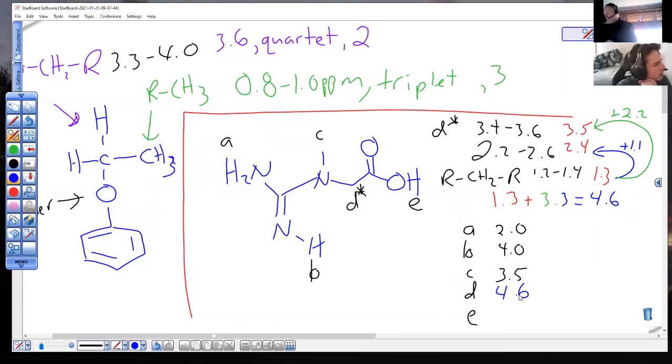Why'd you use RCH2R for D? I had to. What would be the closest match if this isn't special and this isn't special? Right, just call them R. Because there's no NCH2R. I wouldn't say it's closer to RCH3, would you? No. That's another category that you could use for your baseline, but it's not as good a match as this baseline, right? And that I call a baseline.